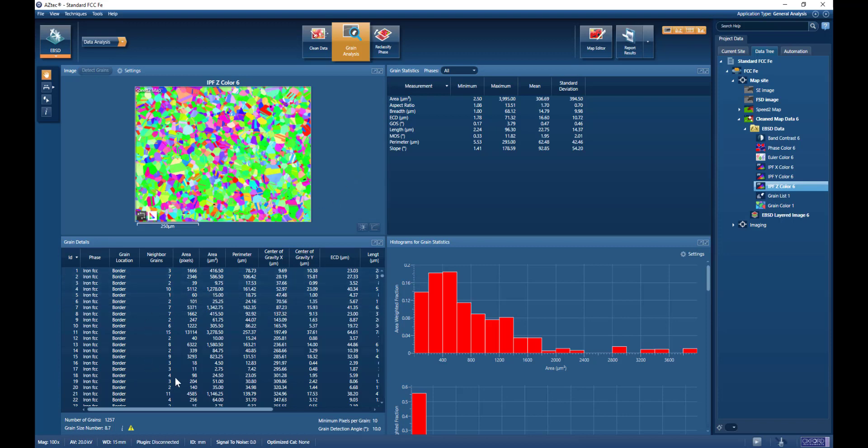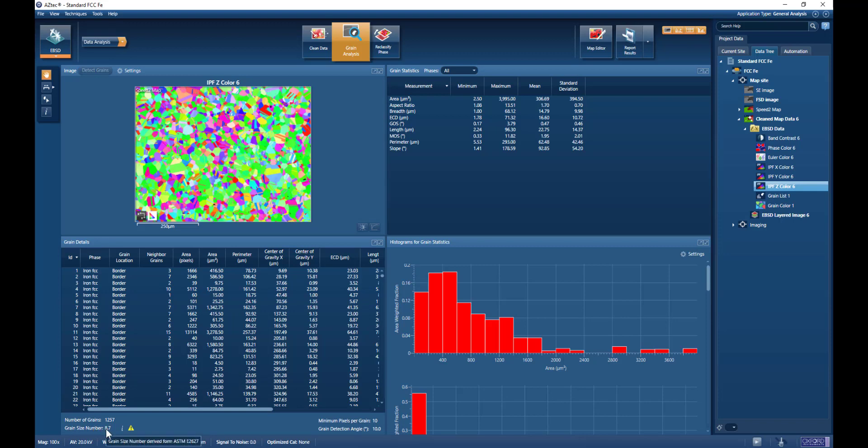And then we get our grain list. We get our statistics here, so we can see the mean, maximum, minimum, and standard deviation.